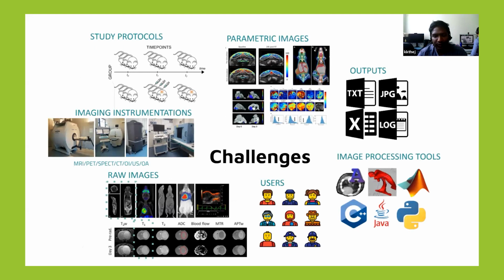We have a huge amount of raw data coming from all these imaging instrumentations. We have different parametric images.